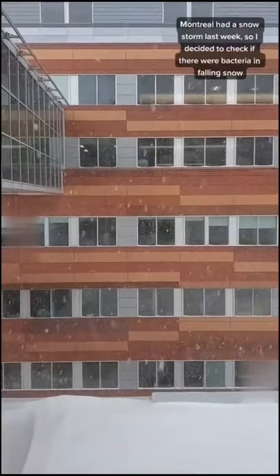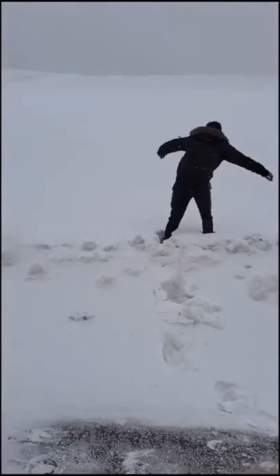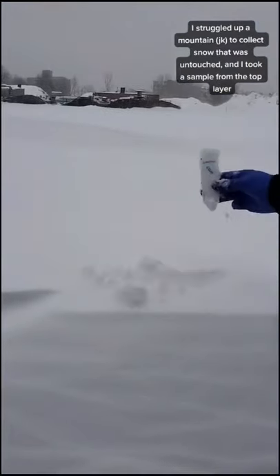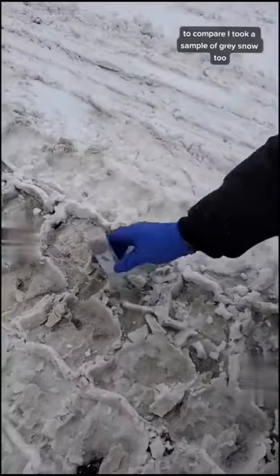Montreal had a snowstorm last week, so I decided to check if there were bacteria in falling snow. I struggled up a mountain to collect snow that was untouched, and I took a sample from the top layer. To compare, I took a sample of grey snow too.